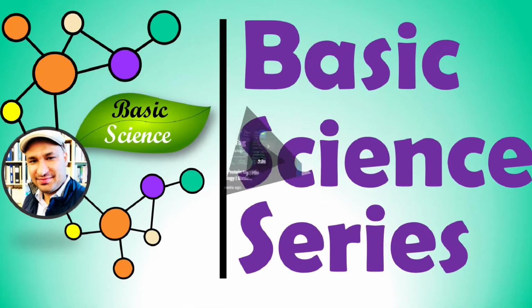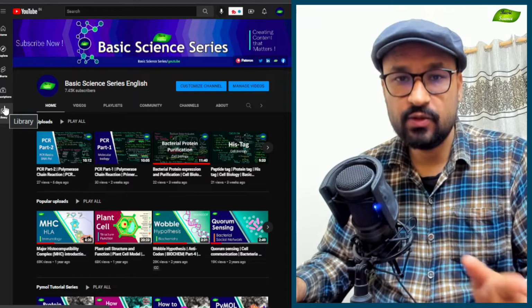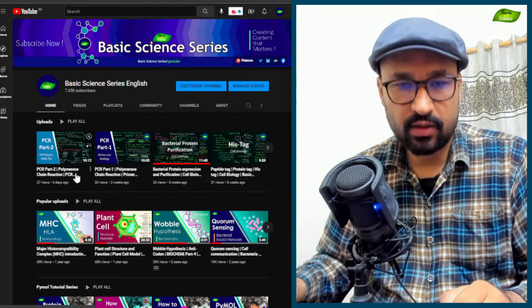I'm your host Loginder Kumar, and today what I'm planning to do is use some of the tools that I use for primer designing, and I will try to design some primers for you. This video is going to help you understand what primers are, how primers are designed, what the concept of primers is, and why they are important, especially focusing on the genetic engineering part.